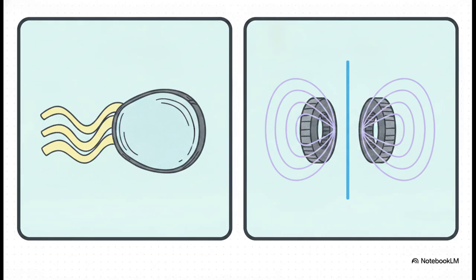And because we aren't using physical light, we obviously can't use physical glass. Glass lenses refract light rays, sure, but an electron beam would just blast right into the glass. Instead, electron microscopes use heavy electromagnetic coils as their lenses. They manipulate the angles of the electron stream using magnetic fields to precisely focus the image onto a digital detector.